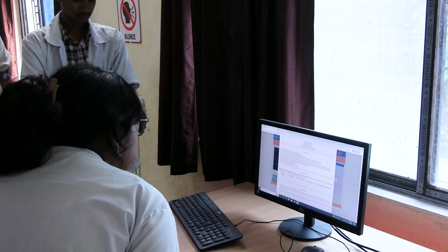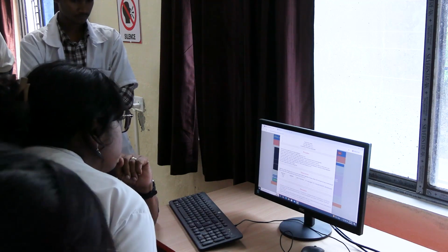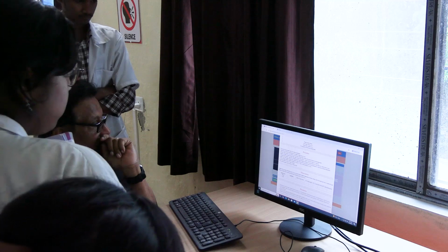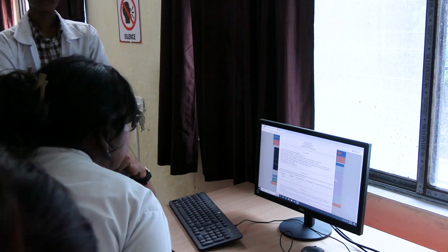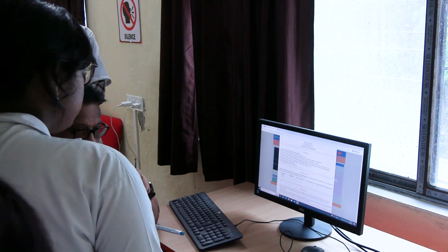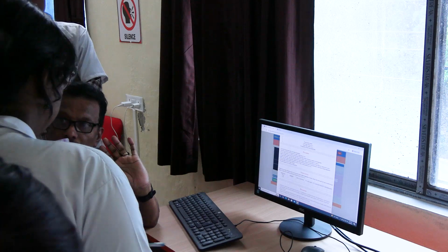Dissect the frog and make ready the nerve muscle preparation. Second, mount the nerve muscle preparation for recording of simple muscle curve. Third, record a simple muscle curve on the revolving drum with the ringer solution in the muscle trough at room temperature. Fourth, replace the ringer solution with the warm ringer solution and wait for 1 to 3 minutes to allow the muscle to warm up. Fifth, using the same baseline, same point of stimulation and same strength of stimulus, record the effect of warm ringer on a simple muscle curve.